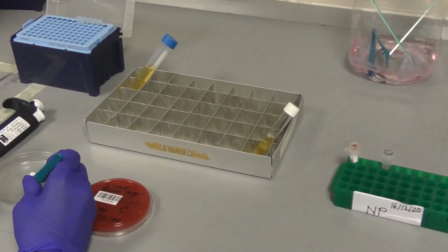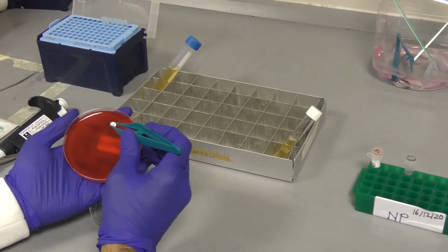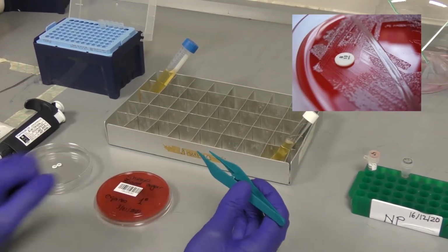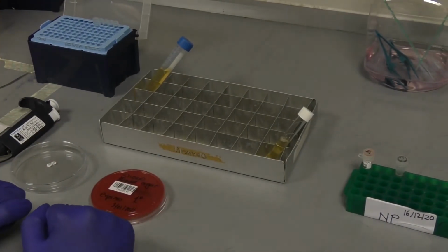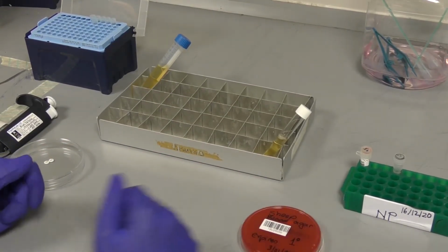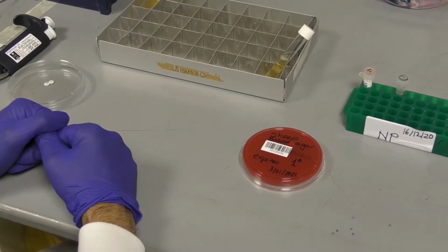Once this is done, then either using disposable forceps or flamed metal forceps, place an optochin disc between streak 1 and streak 2. Repeat for each primary plate. These can then be placed in a 37-degree incubator with 5% CO2 for overnight 24-hour culture prior to reading.